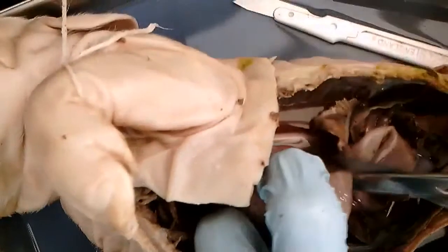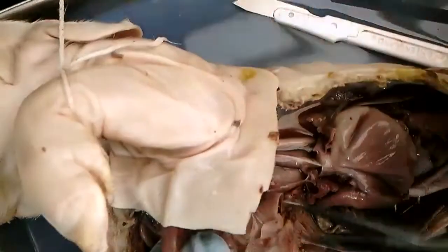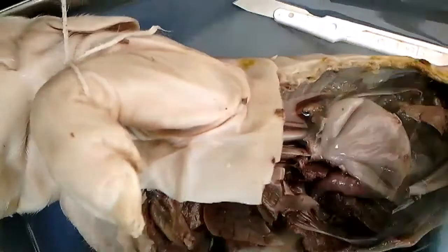And you can do the same thing with the lungs if you like. When I did this similar type of workshop at P2C with high school students, we cut everything out, even the brain. So there's a lot you can do with this.